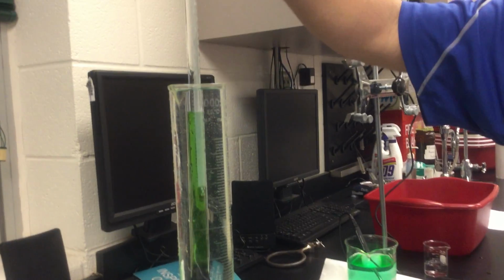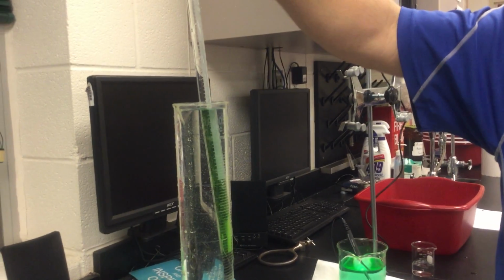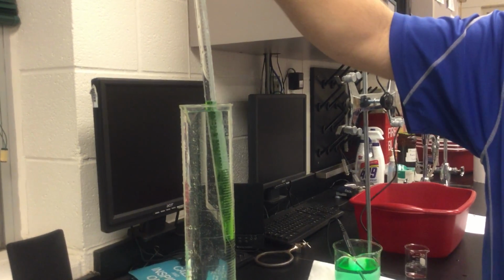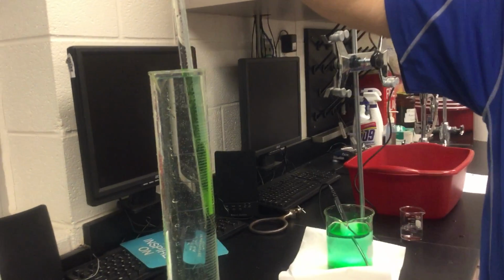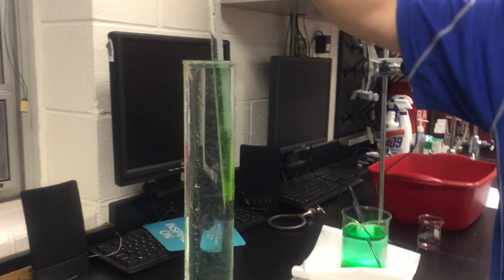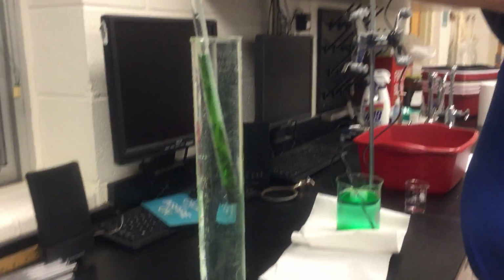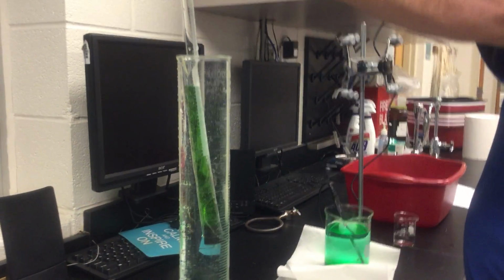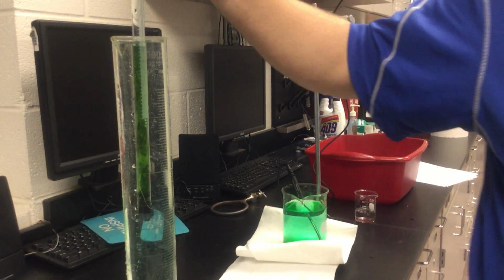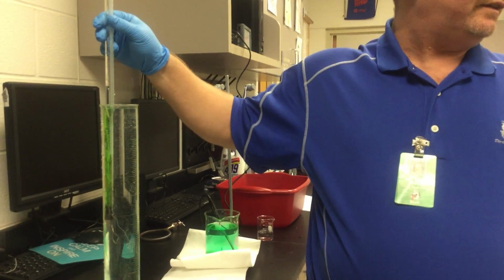So what I'm going to do is get back to my pressure, and I'm going to say right now with the pressure where it should be, we're going to say 40. Okay? 40 milliliters is my volume of the gas being collected.